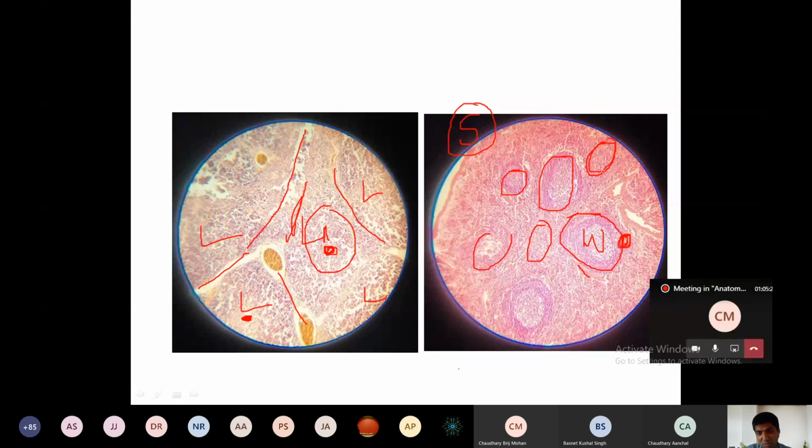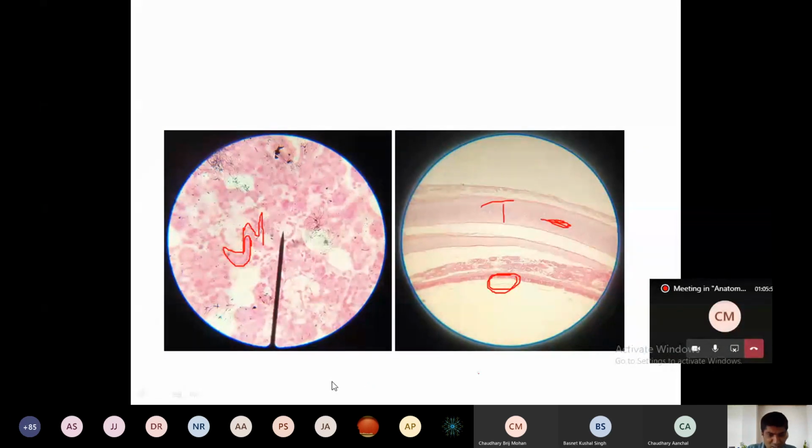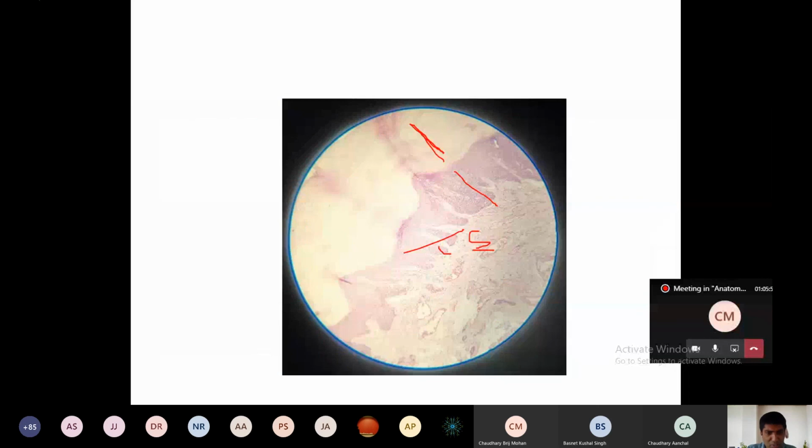The filtrating part of the spleen you can explain very briefly. You don't need to detail the explanation in the examination. You can do it within 2 or 2.5 minutes, whatever time is provided. Briefly, you can write all these very essential structures. I'm watching the time, it's now 11. I hope you all can at least identify all the sections. I have given you 5 sections. You can count them and prepare all these sections properly.